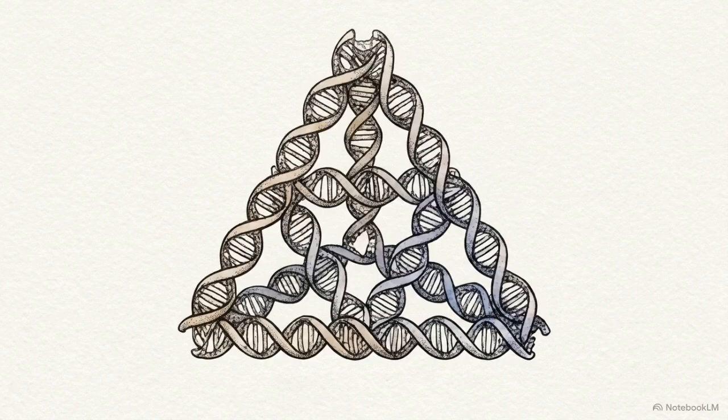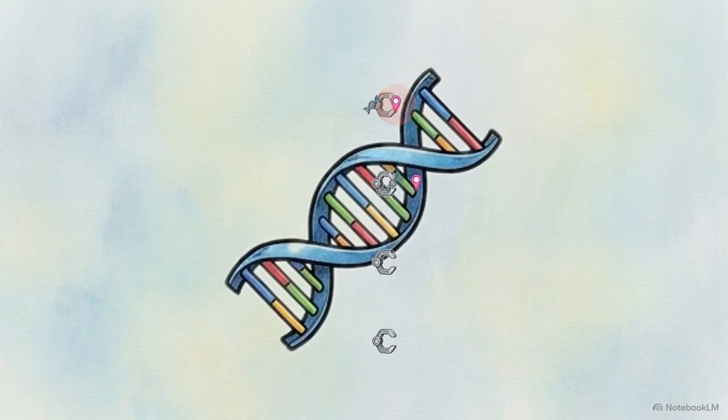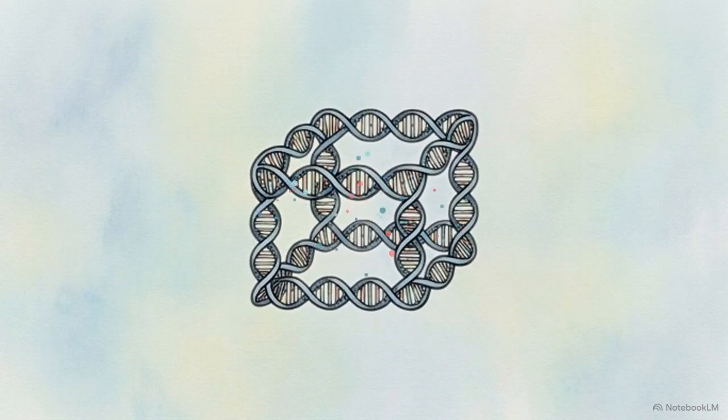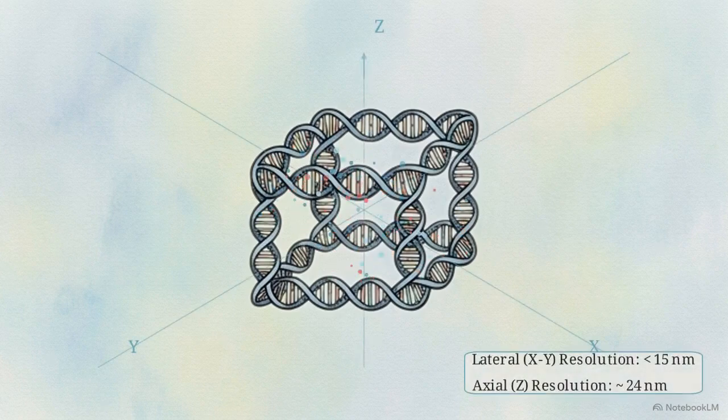We see the application of this mapping in DNA nanotechnology, where 3D polyhedra serve as programmable molecular breadboards. The DNA PAINT method relies on the transient, reversible hybridization of labeled oligonucleotides, rather than permanently attaching fluorophores to the structure. Short, fluorescent DNA strands continuously bind and unbind from specific docking sites on the origami structure. These highly predictable binding kinetics provide the exact blinking rate required for localization algorithms.